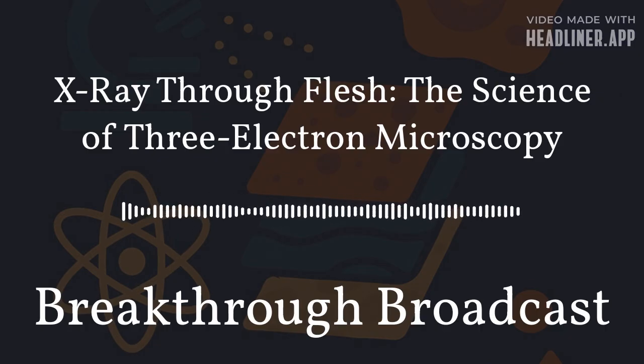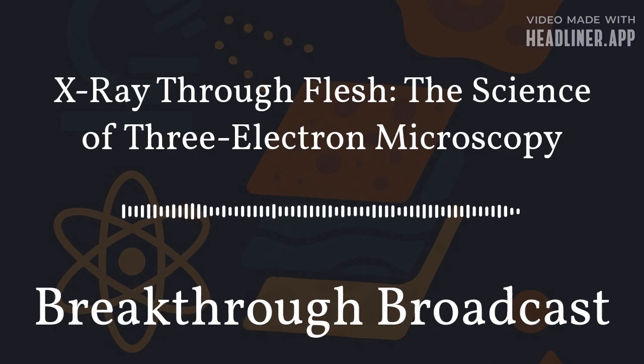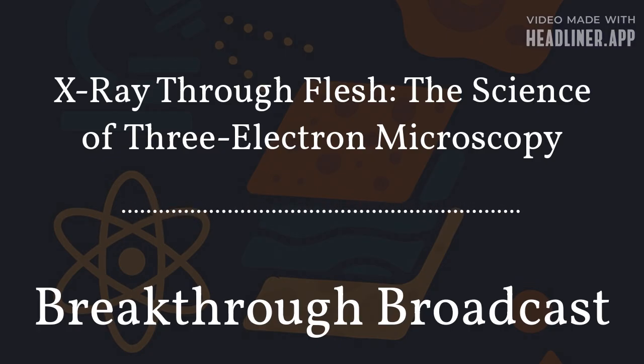This technology has a lot of impact, and that impact spans many disciplines. In neuroscience, mapping neural circuits requires simultaneously visualizing axons, which are part of the neural cells, dendrites, another aspect of those cells, and synaptic junctions, and the environment surrounding them.